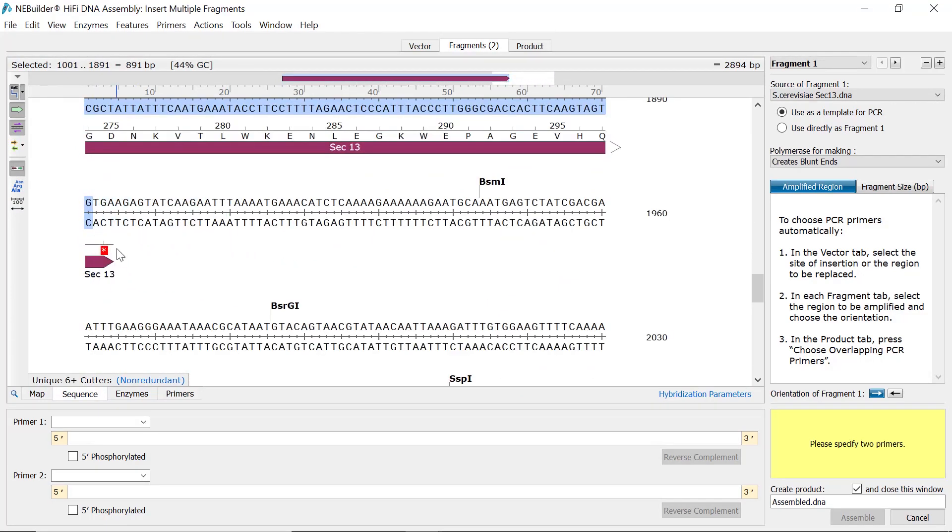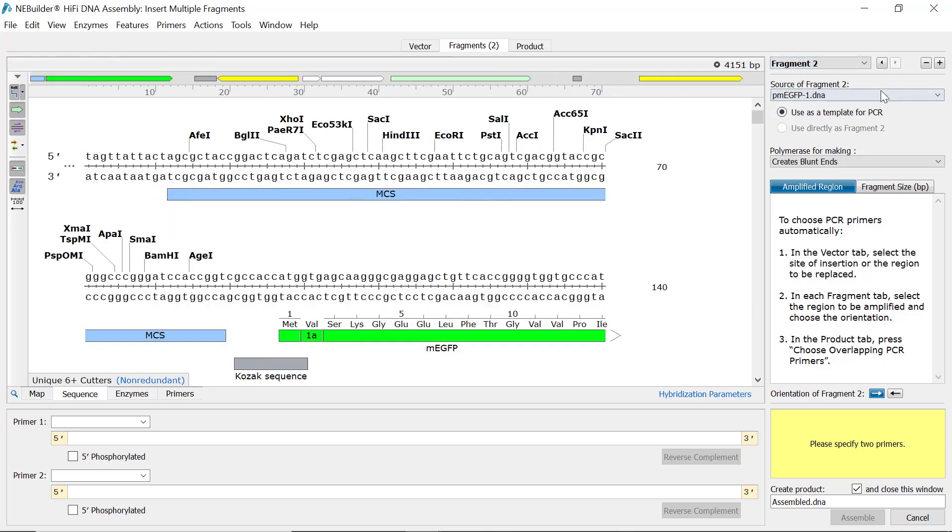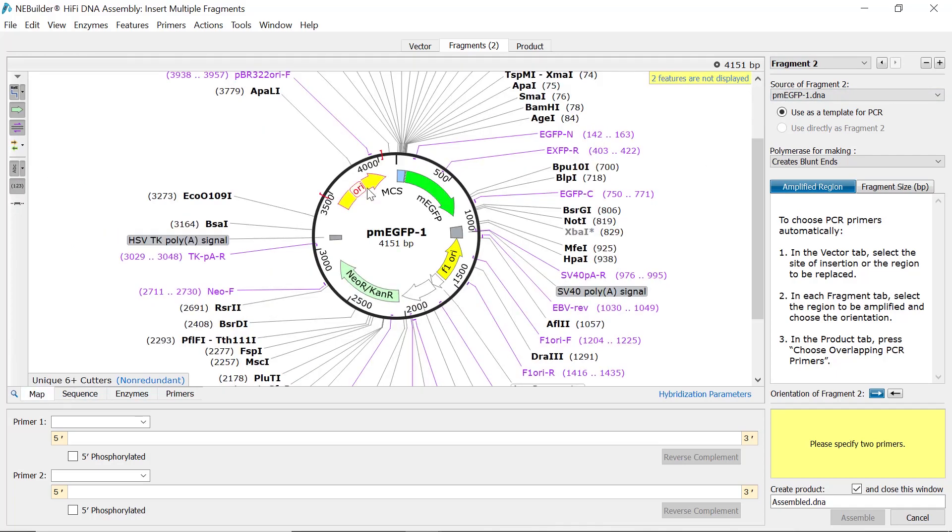Next, switch to the second fragment file by either using the drop-down menu or pressing the right button. As before, it's then a case of selecting the desired feature or sequence to use as the insert.